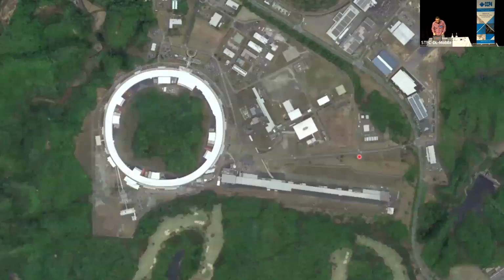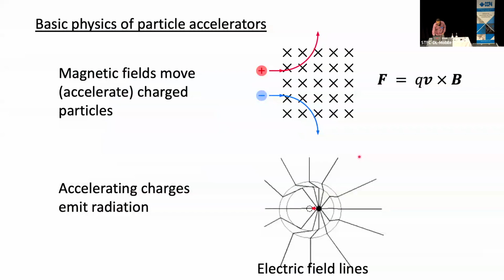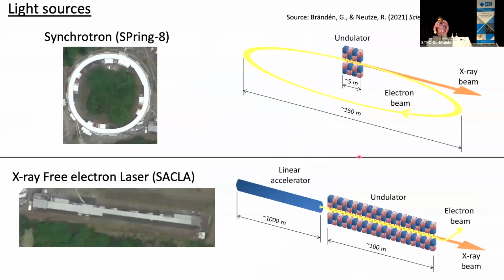Okay, so where do you do this kind of experiment? This is done at free electron lasers. You can do serial crystallography also at synchrotrons, which we'll hear more about later. But this is the SPring-8 facility, and you have the SPring-8 synchrotron there, and the line is the SACLA. And I'll be skipping over a few slides periodically because I think I have way too many.